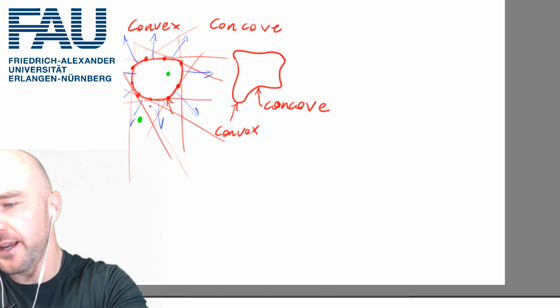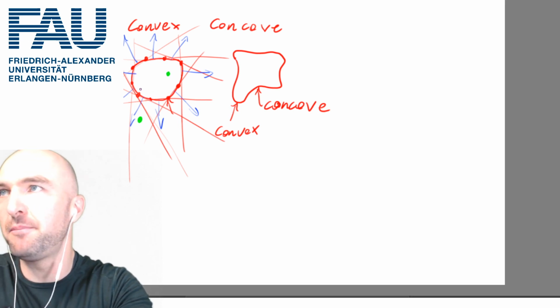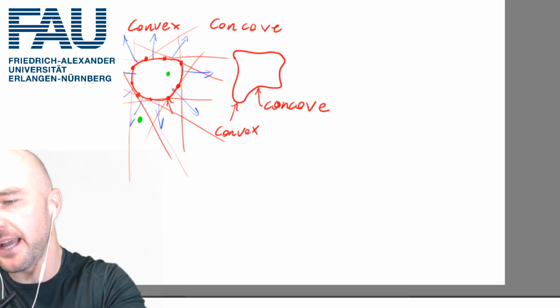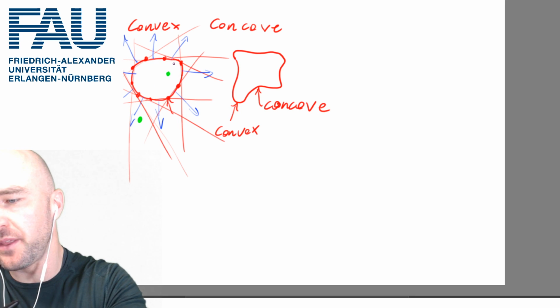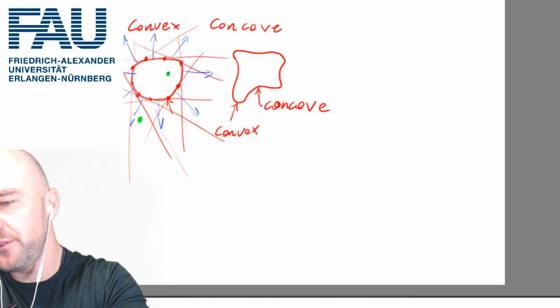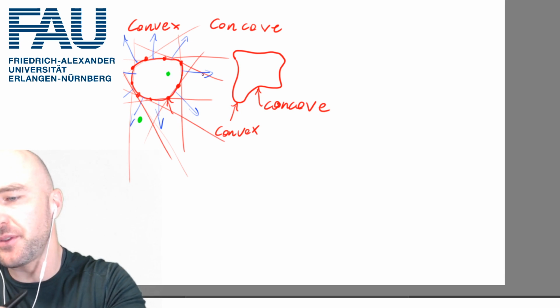What we can do is look up for every single one of those line segments whether each point is on all of the positive sides or on all of the negative sides. And if it's inside, then it's always on the negative side of those surface normals.